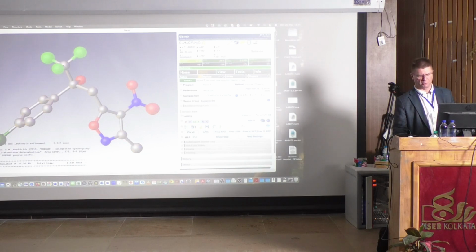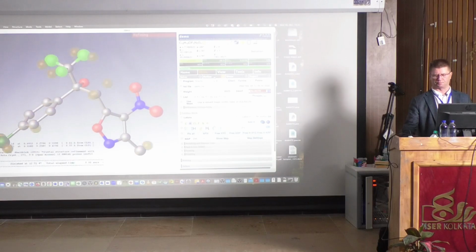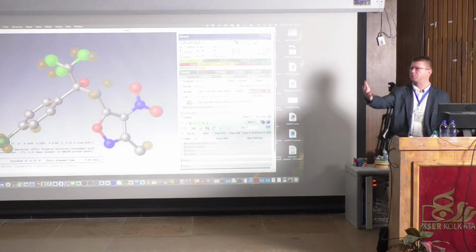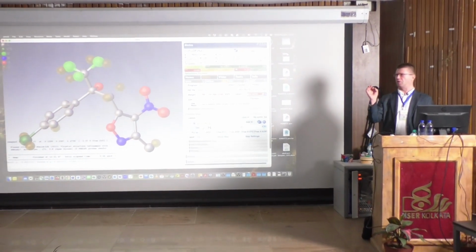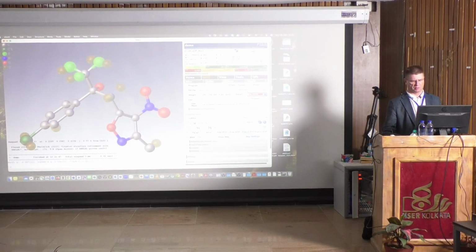And now we go here in this menu. I will activate it. Now we refine. You can see that I haven't clicked the weight yet, but I will just refine it. So it's 4 cycles. Let's see what happens. Now we got already 11% because it has all the atoms. And now you can see the balls are spherical because we have the isotropic thermal movement in there.